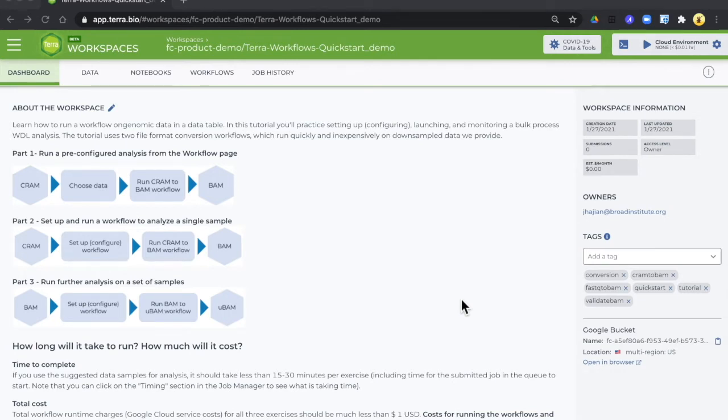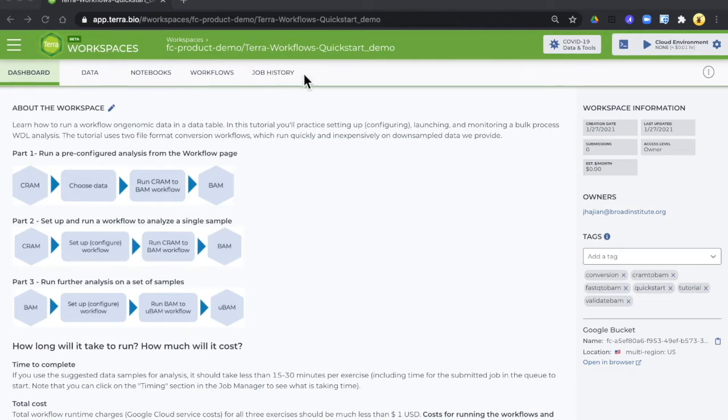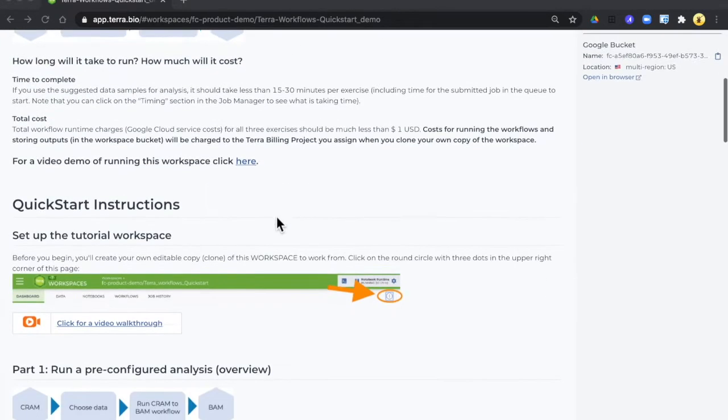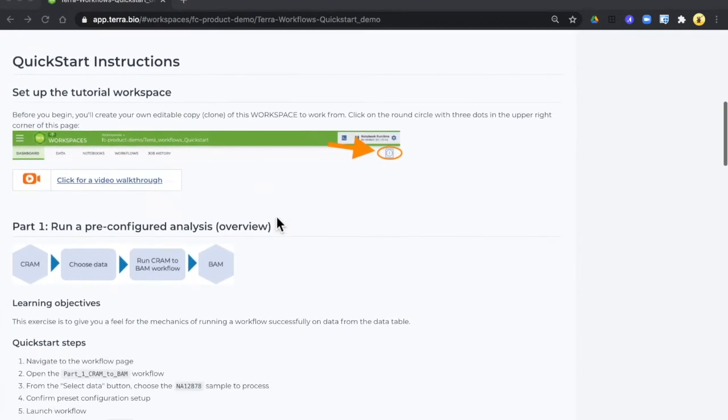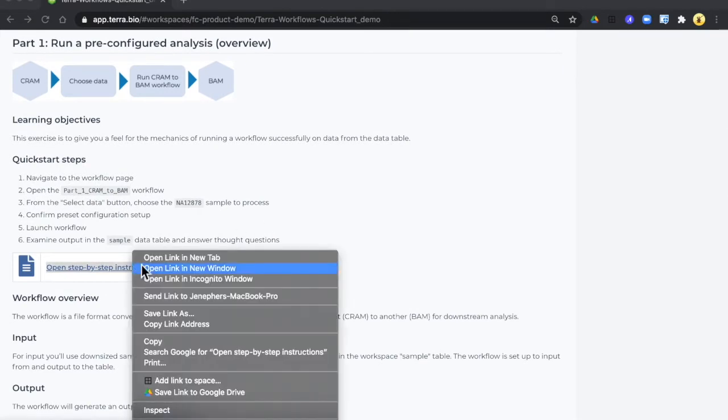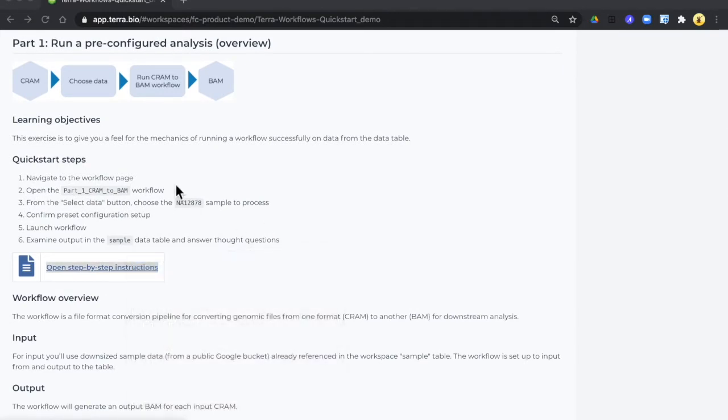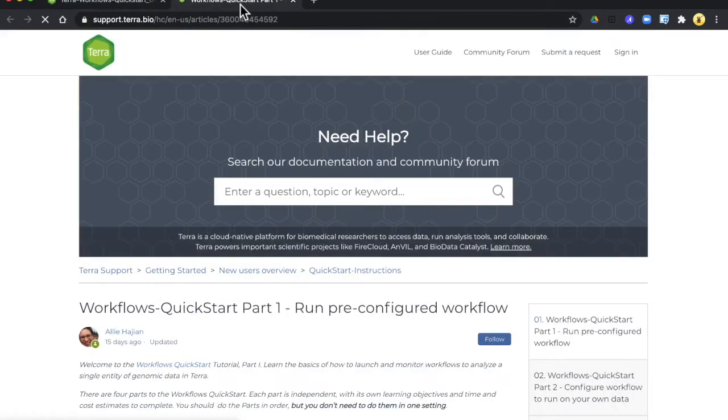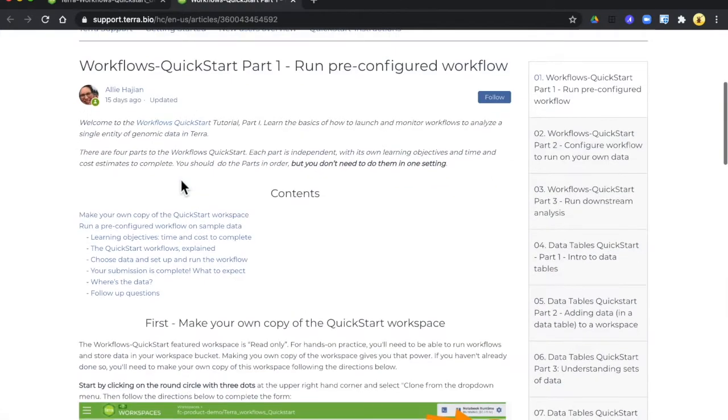You'll know it's your own copy because it will have your billing project listed right up here and the name that you gave it right up here. You can also go down and right-click to open step-by-step instructions in a separate tab.